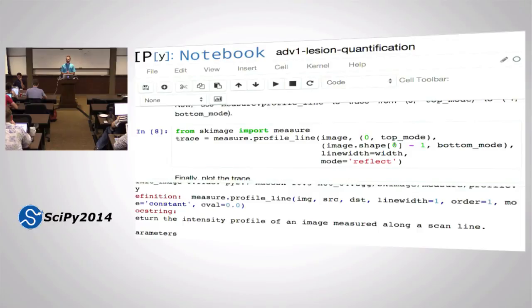Okay, so if everyone hasn't done it, you just pass it the image, the source coordinates. Again, this is NumPy indexing. The destination coordinates. I'm not sure if you can just use -1 indexing. I think you can't, so you have to give it a specific, this particular code. The -1 indexing? Yeah. So that would be a nice pull request.